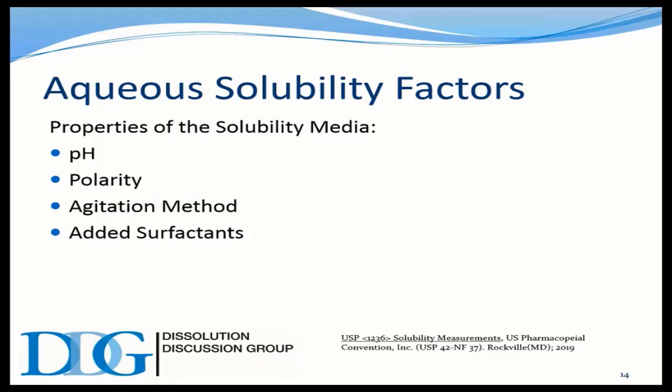Brian, I'll just add one more thing. I guess this might come under surface tension, but the osmolality and the viscosity, especially with injectables, is a very important aspect that you have to consider too. Oh, this is true, yeah. And that's going to apply more toward these nano dispersions and micro dispersions, because they themselves have certain surface energies that make them more or less soluble. Sometimes they are so small they try to clump all together, and it makes them very difficult to put in solution.